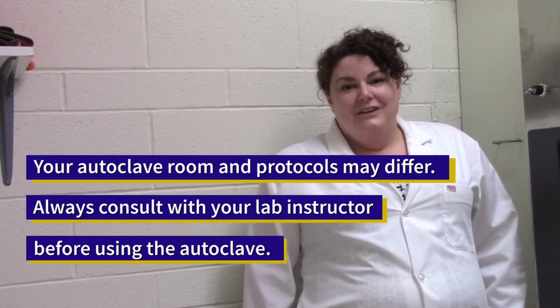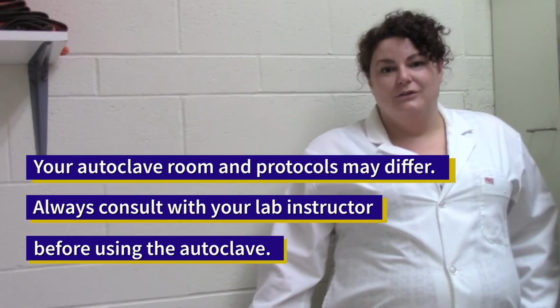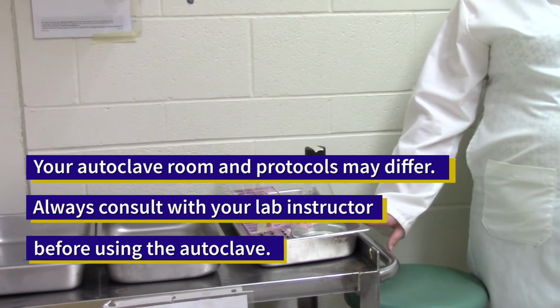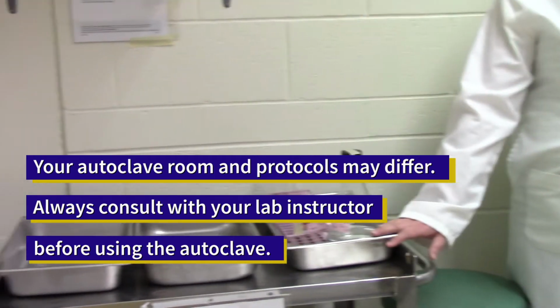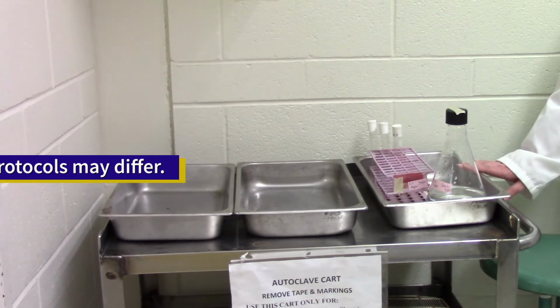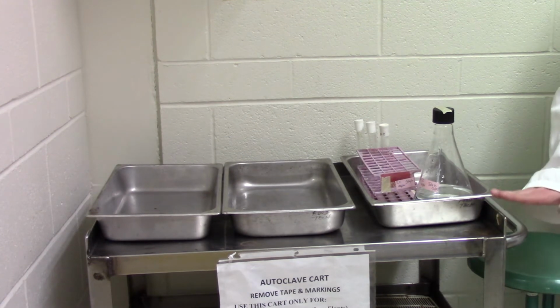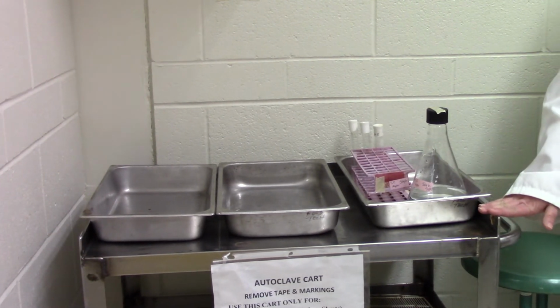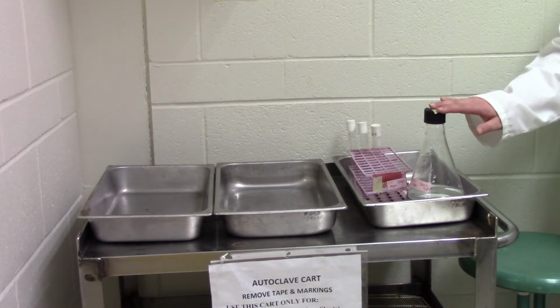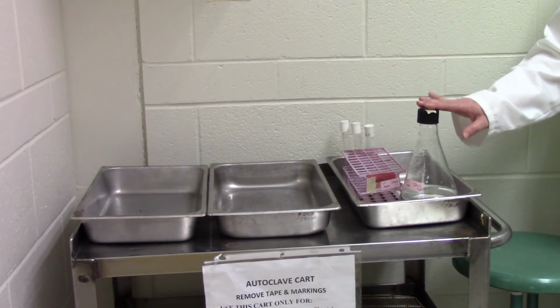Okay, we're back at the autoclave room now, and we're ready to get our stuff loaded into the autoclave. There are a few important safety points to consider here. I do also want to just point out this spot where I've put my autoclavable goods. So we have this silver cart that sits beside the autoclave, and this is where you're going to put everything that needs to be autoclaved. So if your stuff's good and ready to go, you'll put it here.